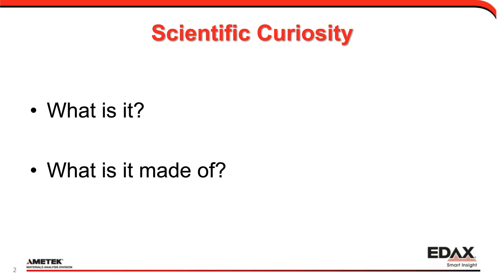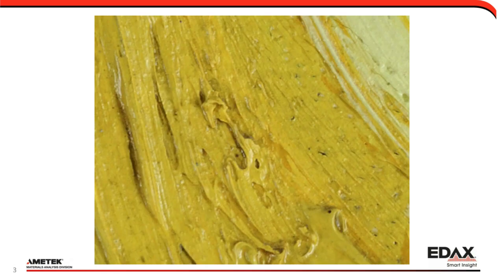For a first example, I'd like to have a little fun first, and I'd like to have all of you take a look at what you see in front of you. What we're doing is looking at the fine details of something. You might look at it and say it might be a freshly painted wall that's maybe not so smooth, or some stucco. If you're like me, you might say that looks like it could be cupcake frosting.